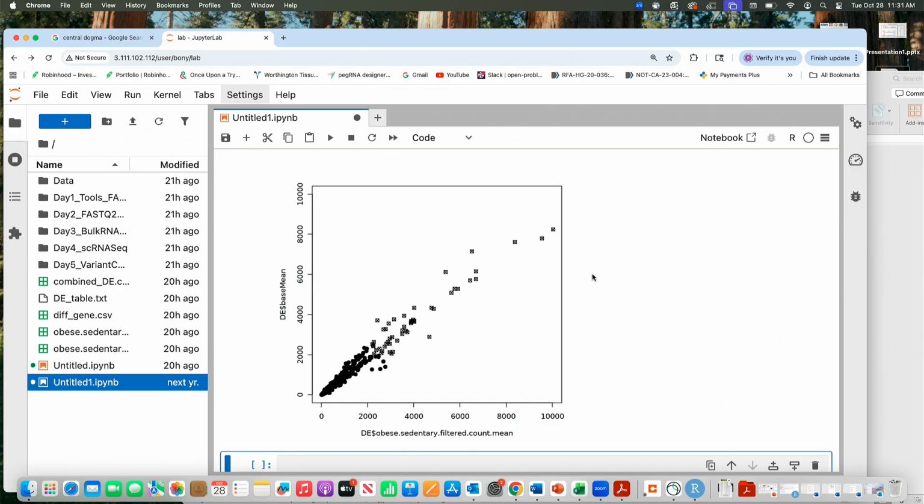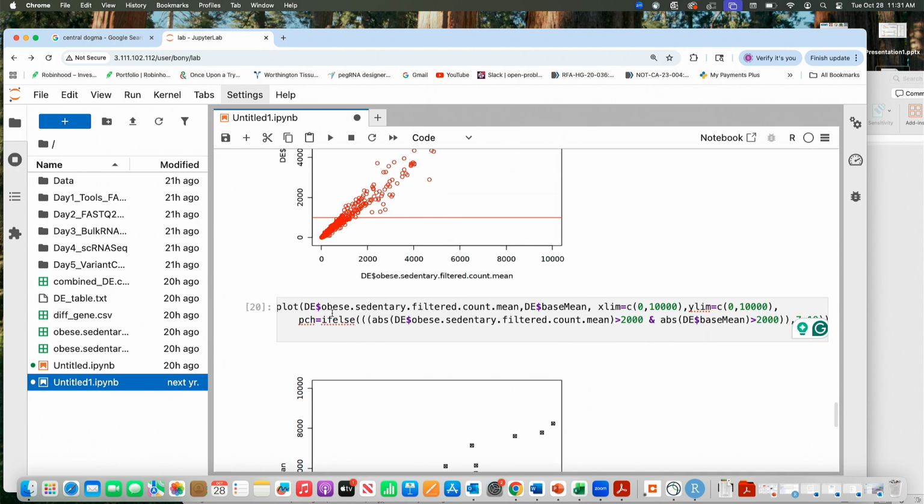Okay. So basically, using an ifelse statement, you can give a conditionality and define color, define shape, and you can define both also. So you can copy this color is equal to, and then also define both statements here. PCH we are using for the shape, so we give two shapes for that, and you can use an ifelse statement for this. Everybody is fine with this? What about you guys? Everybody fine? Okay. Great.